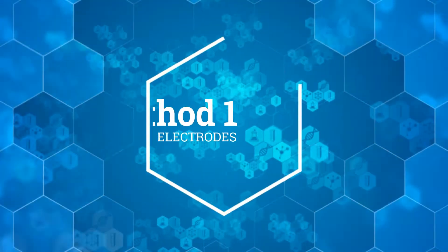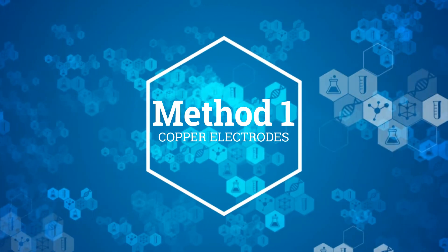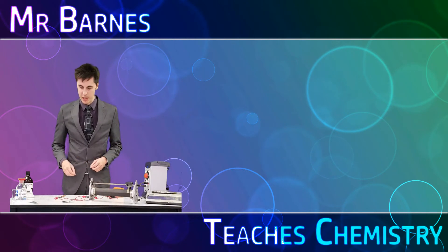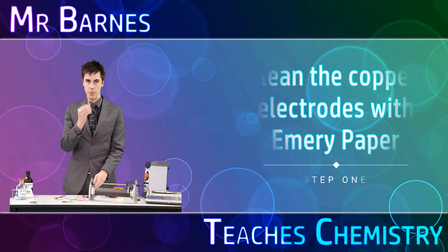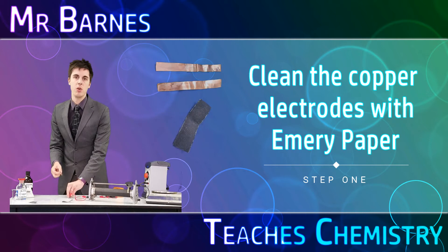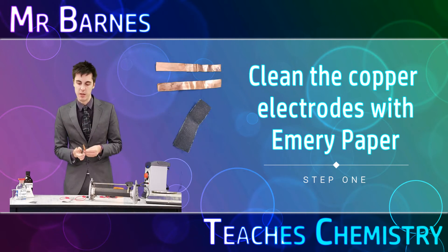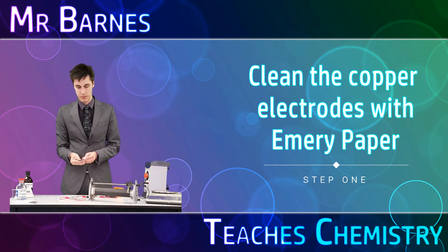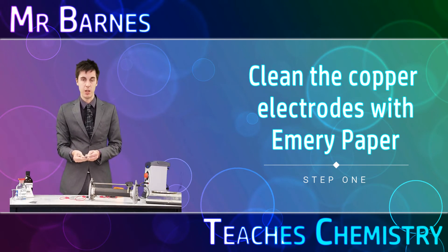The first thing we're going to look at is using copper electrodes to carry out electrolysis of copper sulfate. The first thing you want to do in this experiment is get yourself two copper electrodes. You need to make sure these are completely clean, so get yourself some emery paper and scrub them and clean them. Do this for a few minutes to make sure there's no dirt left on the actual electrodes.